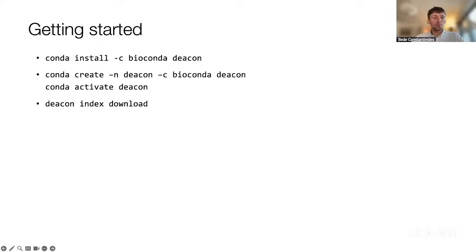Yeah, you could do some work, and again, you can do this using the Deacon command line, and there are some instructions in the README of how to do it. But basically, by default, it should work better than any other tool that I'm aware of. But if you really wanted to maximize its performance, you could perhaps mask the existing database with a custom collection of phage genomes that's more expansive than the one I've already masked it with. So yeah, you could certainly do that and look into the masking.